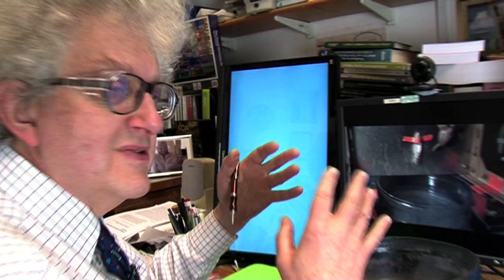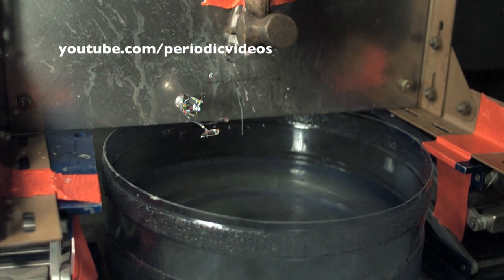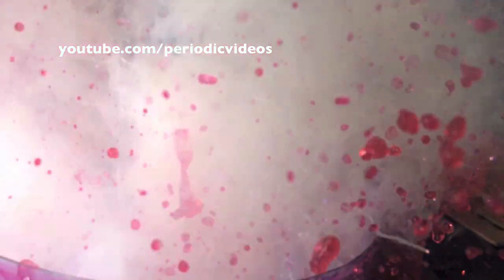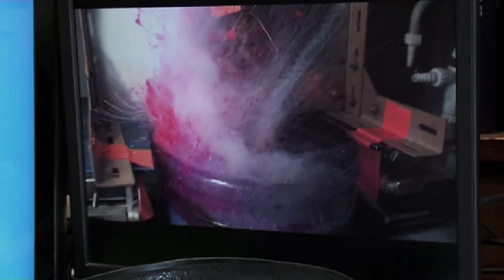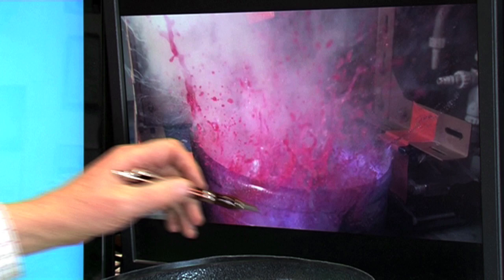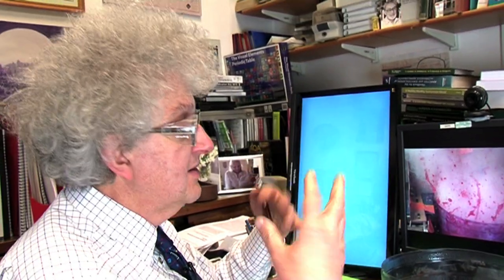What you'll see at various points is a strong purple colour — or perhaps lilac might be better — which is actually the emission of light from the vapour of the rubidium. Rubidium is well known to give this rather nice colour. And everything is getting so hot that you can see emissions of this light, which is perhaps slightly masked by the pink colour of the indicator.